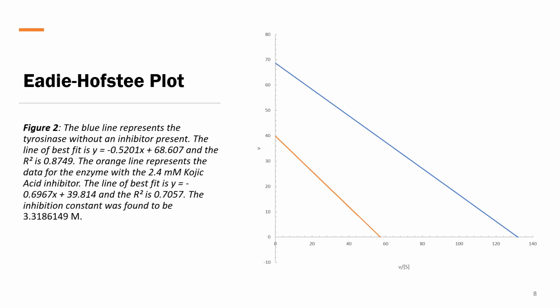So based upon the line patterns of this plot, we can guess as to what type of inhibitor is affecting an enzyme. So if we already have this information, or we got our data, as we can see from the previous slides, then we just put it onto this Eadie-Hofstee plot, and we can see a lot easier what kind of inhibition is happening here. So we can also see, I just want to point out a few things.